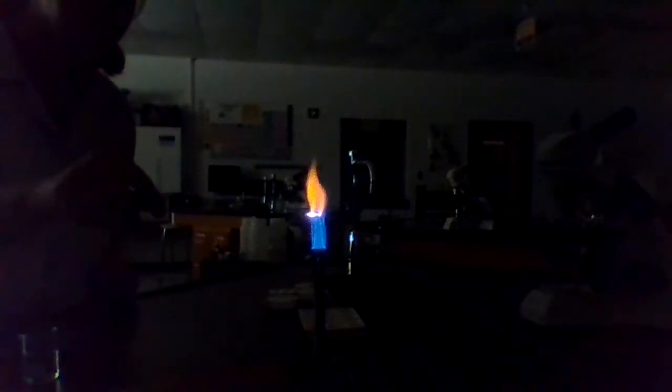This one is calcium chloride, so it should go in the third one. Hopefully we put it in the right order and it's calcium chloride. I think it's calcium. Well, I'll know the minute it goes in the flame. Yep, calcium. This is red, bright red with some orange, but bright red. Wait, let me do it again. All right, we'll do it a second time.